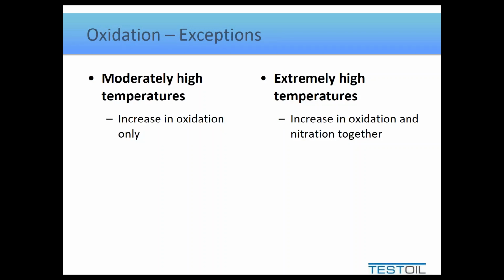It doesn't necessarily tell you how bad it is. That's going to be based off of how high the oxidation result is getting. But in terms of what the mechanism is, and if it's a particularly high temperature, which would mean a very significant starvation of lubricant, or otherwise a hot spot within the system created by friction, combustion, or lack of oil flow. So these are kind of your balancing checks, if you will, as to what your oxidation is telling you.